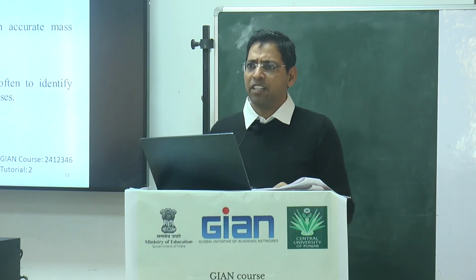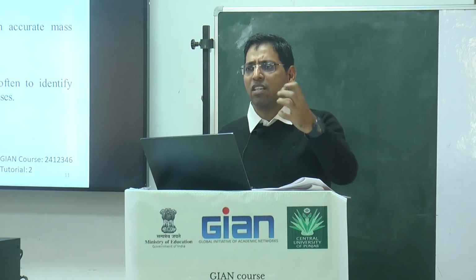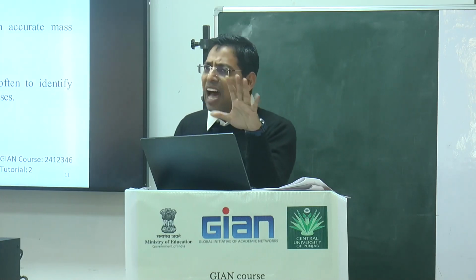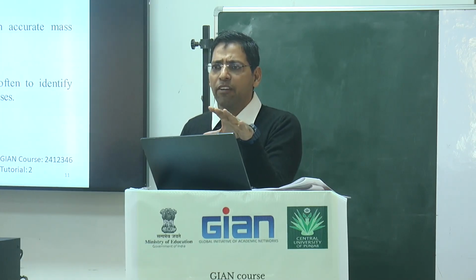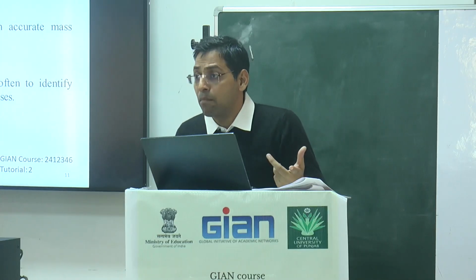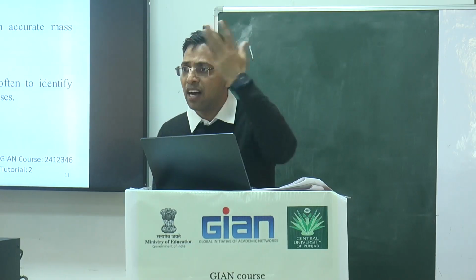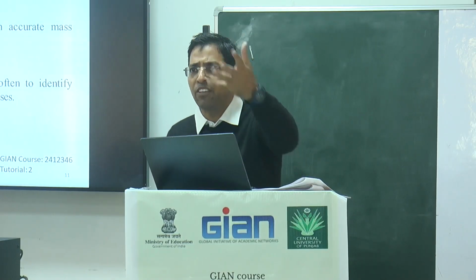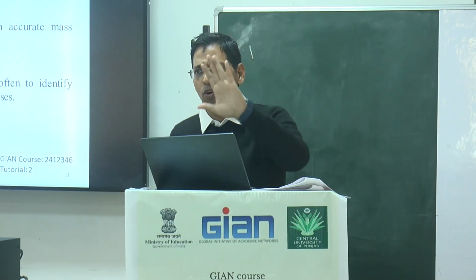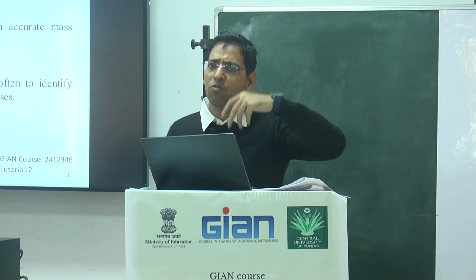It was an example of a disease, so you are looking here for the disease. So if there are 2 persons, one has some medical issue, and the second one is healthy. So ultimately in the targeted, you are going to the labs and giving your blood sample for identification of some disease or some marker. Whatever they're looking for, some biomarkers, those biomarkers are already identified as associated with a different disease actually. So in the targeted metabolites, we know that biomarker, we are analyzing the metabolics, and we can do it. And you can go predictive also.